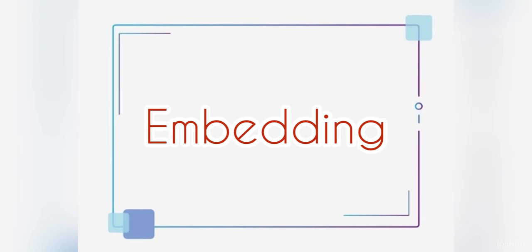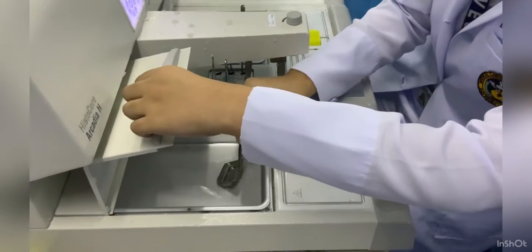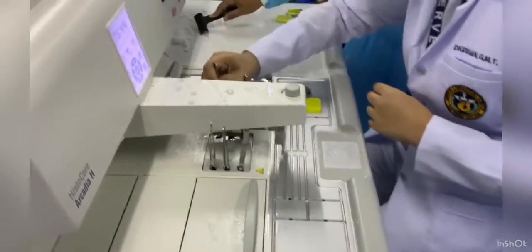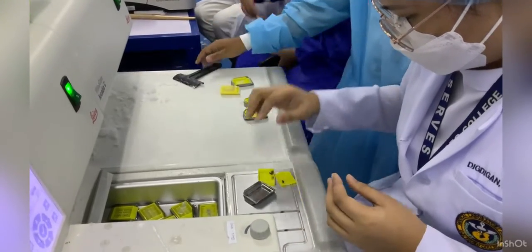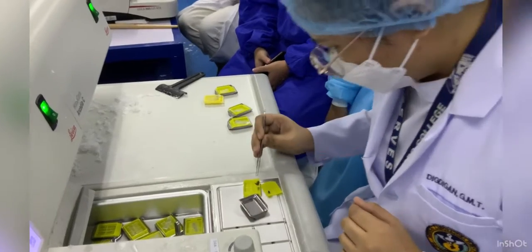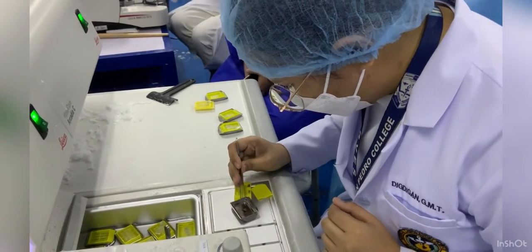After impregnation is the embedding. Now that the specimen is thoroughly infiltrated with wax, it must be formed into a block which can be clamped into a microtome for section cutting. First, find a cassette with tissue specimen and transfer the specimen to a steel mold. Make sure to center the specimen inside the mold.